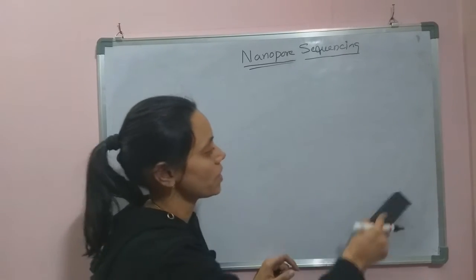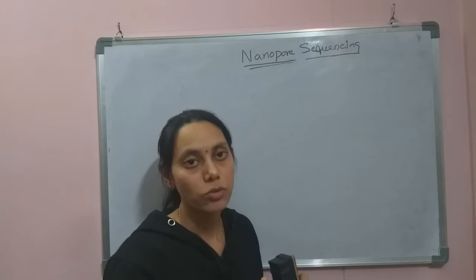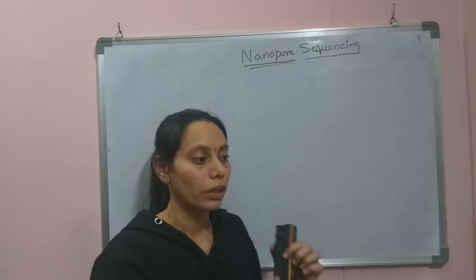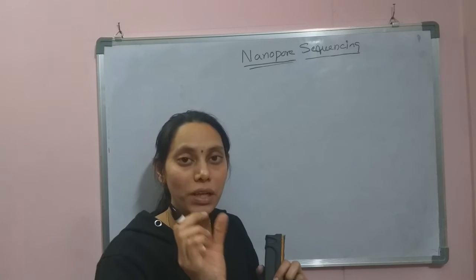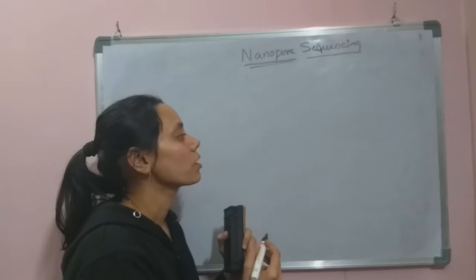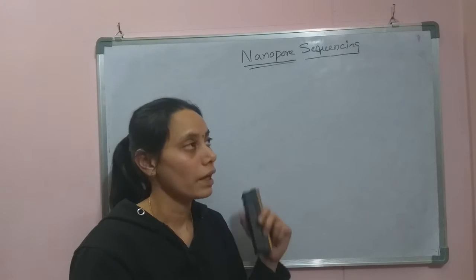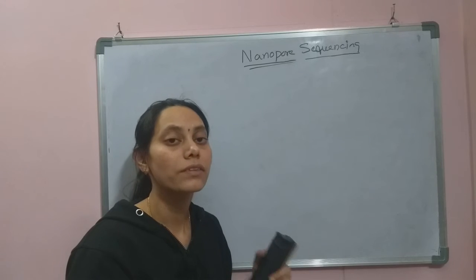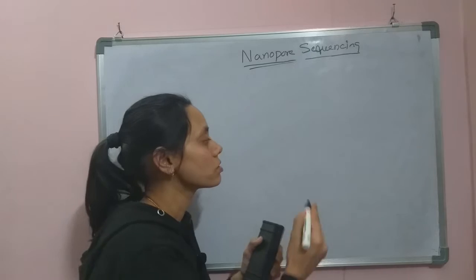These are basically membrane units, that means protein units embedded inside the plasma membrane. They make physical barriers that allow only the typical size of molecules to go through. These types of membrane proteins can be directly taken for nanopore DNA sequencing, or they can be synthetically prepared using polymers.